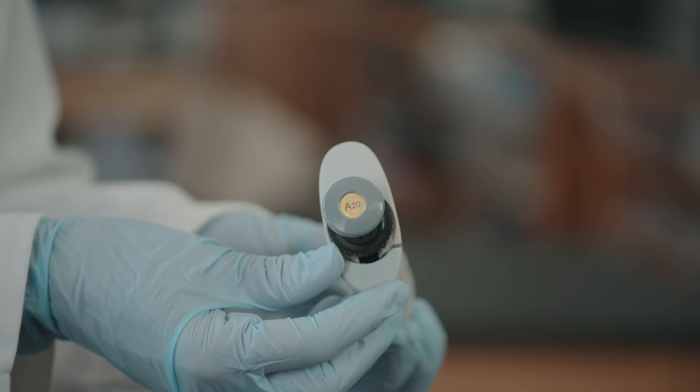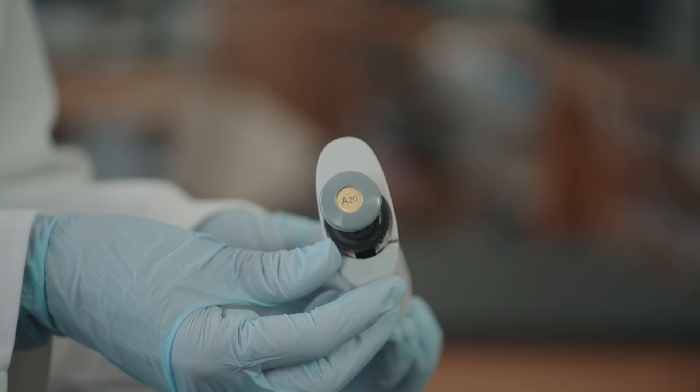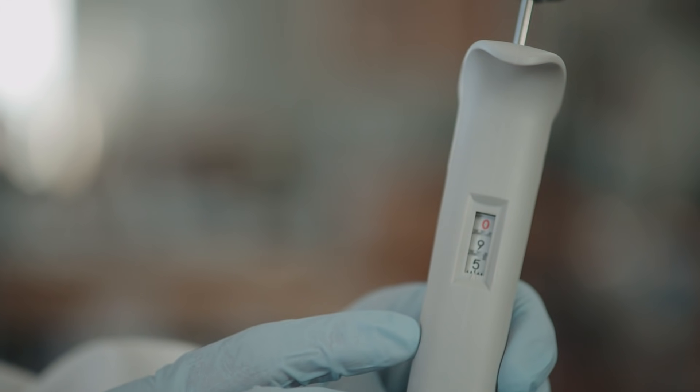This is a P20. It is used to measure volumes from 2 microliters to 20 microliters. This window on the pipette shows the volume of fluid that the pipette is set to take up.